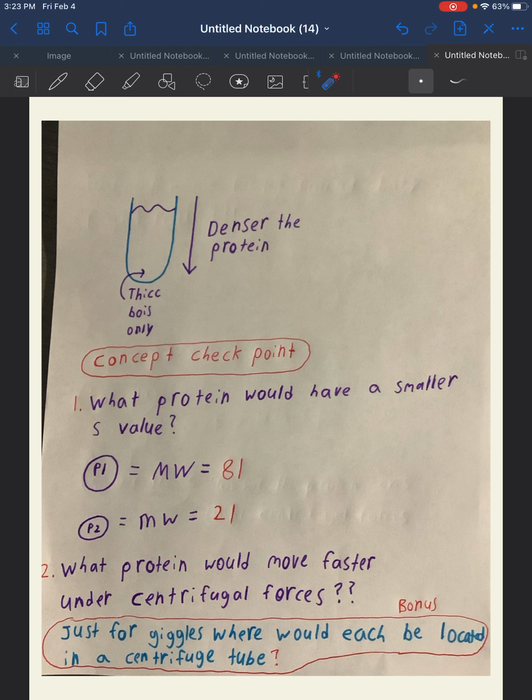So, if you recall from my previous video, we went over how to form a homogenate, and the homogenate was basically how you break up a cell in order to obtain the cytosol, which is a soluble protein that can then be used under purification processes.